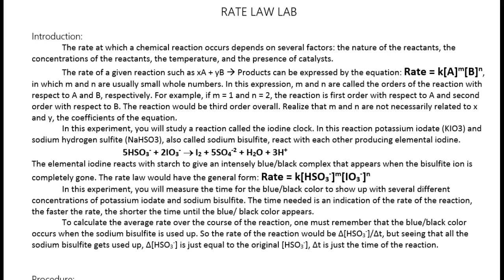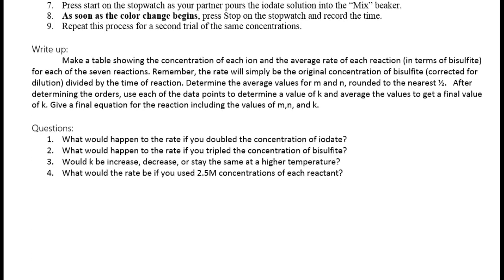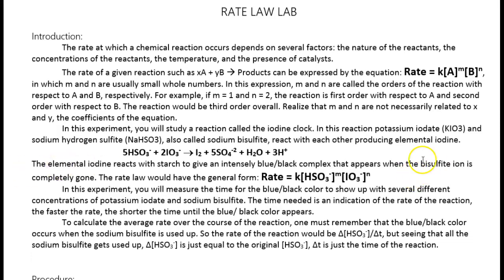So we're going to talk about your rate law lab, which we'll be doing next time. And this is a lab in which you are going to be determining the rate law for the reaction that you see down here. Obviously, you want to take a little bit of time to read the introduction and even the procedure and even everything on the back of the sheet there, the write-up and the questions. Okay. But after you've done that, let's talk a little bit about what you're doing.